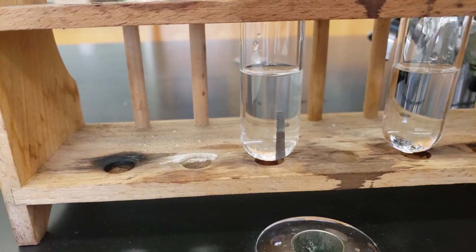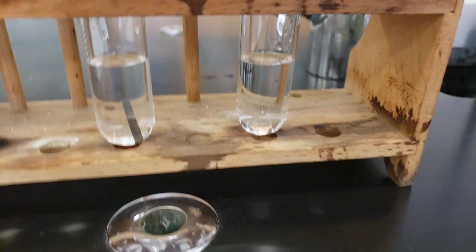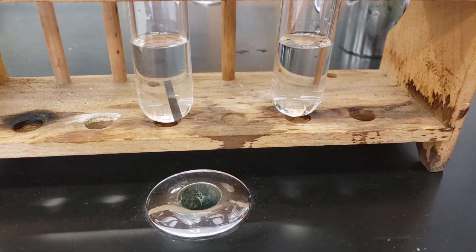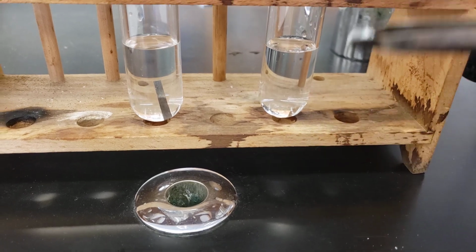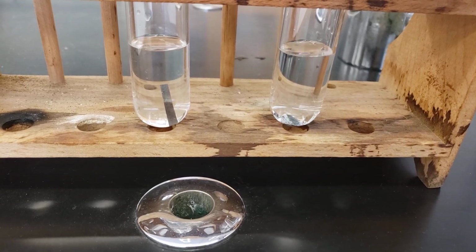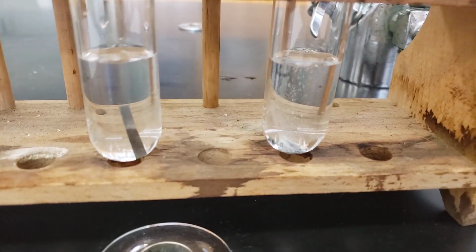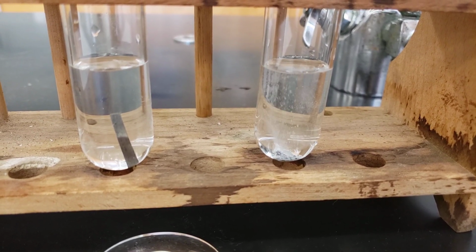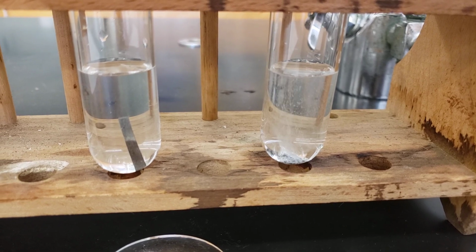But as we take a gander down the periodic table one level, we get to calcium directly below magnesium. And when I take my calcium and I add it to my water, we instantly notice that something is up. It starts to bubble and fizz, indicating that it is in fact reacting with the water.